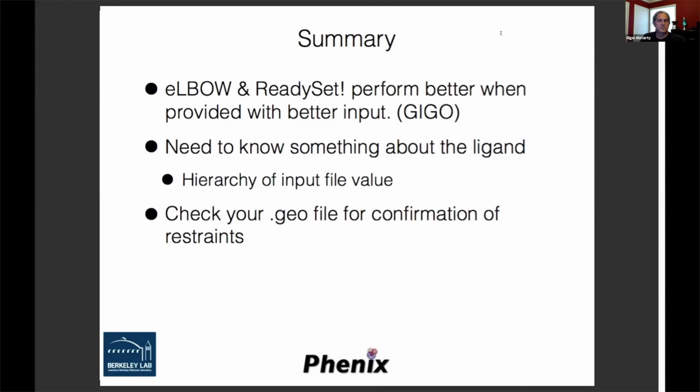It takes default distances from different literature that I've read and added to the file. So hopefully it's quite accurate, but Phenix doesn't rely on the input geometry to create the default bond length. If that answers your question, I see another question about three-letter code ligands in Coot not being the same as in Phenix.